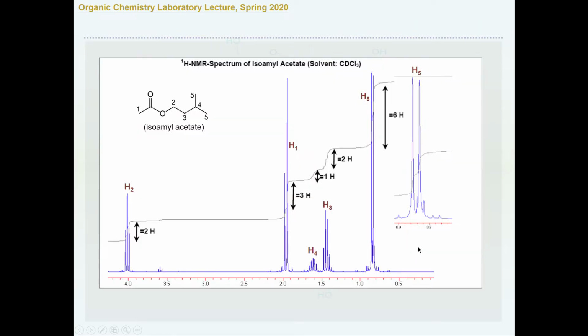So this is very precise on the structural properties that you can observe in the NMR spectra. I give you the last viewgraph as an example, with an ester group identical to what you have. It begins with the first proton, a methyl group right next to the carbonyl. Because of the electron withdrawing from the carbonyl, the electron density is lower, so it will be a downfield shift. It has shifted to about 1.9 ppm, and a carbonyl like acetyl is typically 2.1 ppm, so it's very, very close to that.